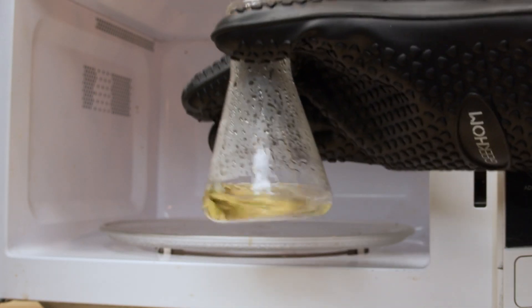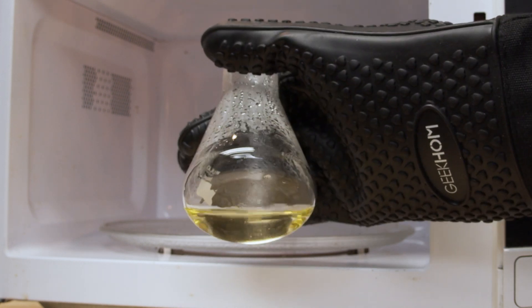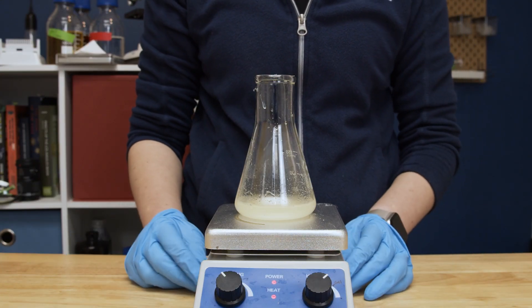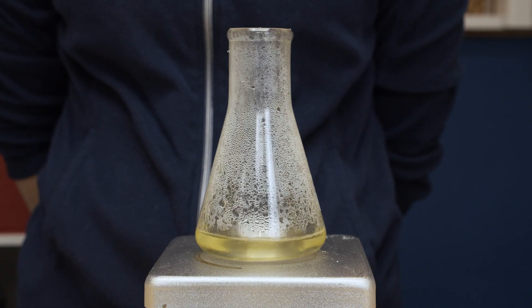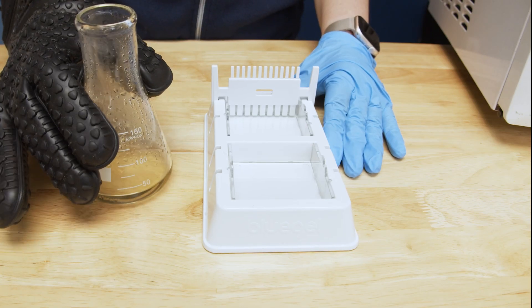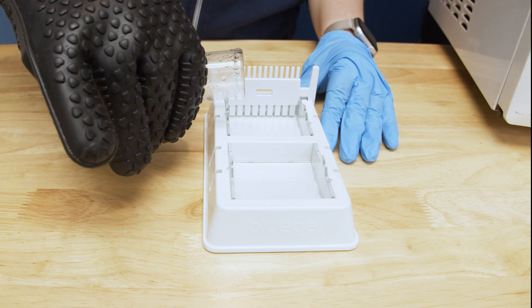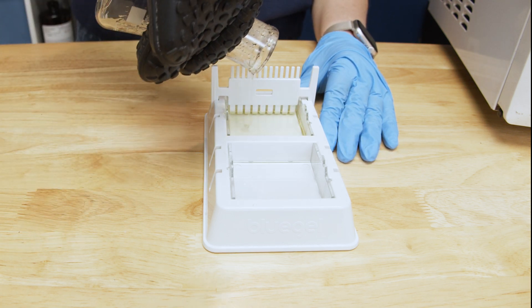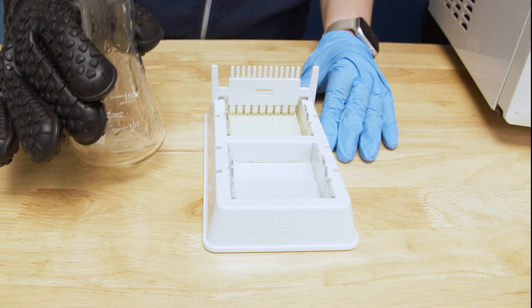Because the DNA stain has already been added, the solution will have a yellow or orange tint. You can also use a hot plate if a microwave is not available, but this will take longer. Ensure that the all-in-one tab has broken up before heating. Once you have prepared the agarose solution, pour it into the assembled gel casting tray. You can pour the agarose solution immediately into the tray — you do not need to wait for it to cool.